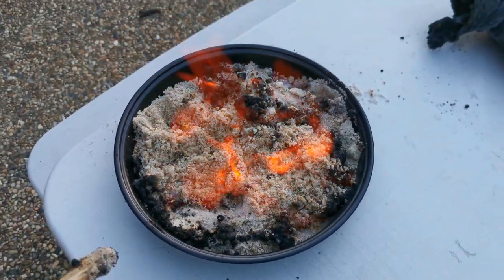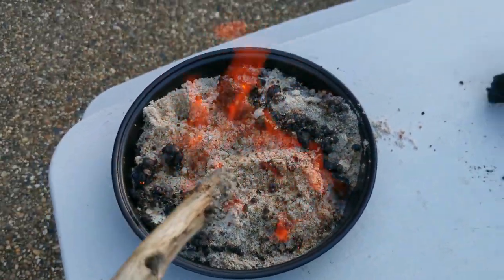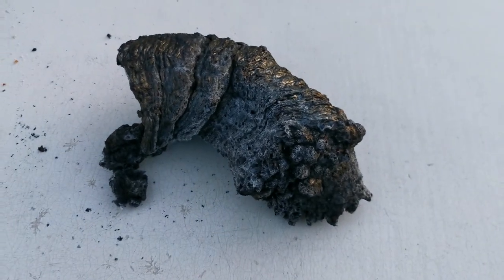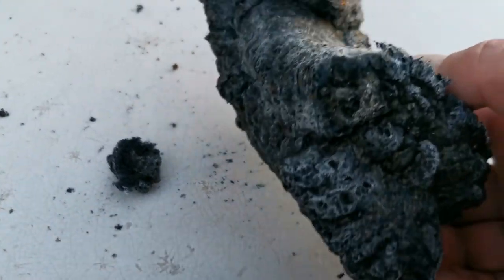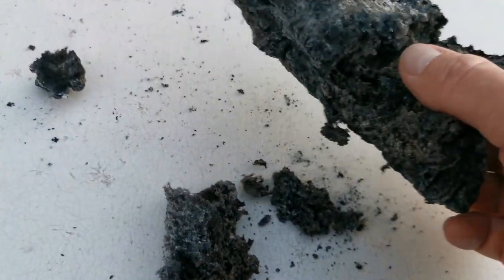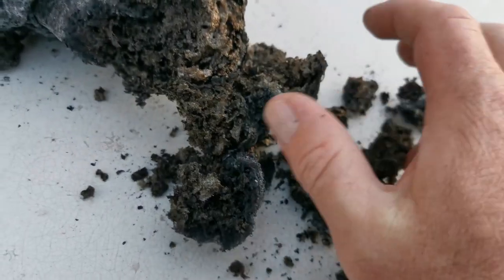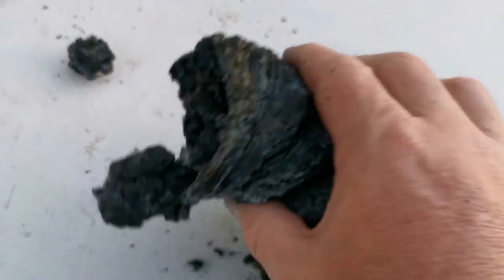Now would be a good time to bring out the marshmallows. And over to the right we have our snake - a short fat snake. Now this is carbon but it's very, very light and fluffy. You're not going to be able to tell that, but take my word for it. Very light and fluffy. Squishy.